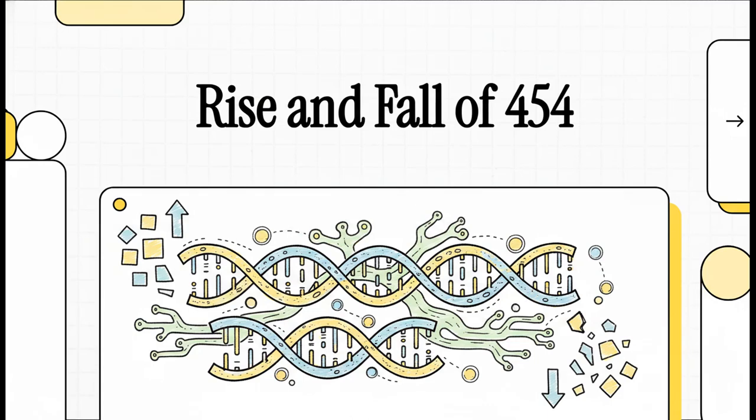Today we are diving into a truly dramatic story straight from the world of biotechnology. We're talking about the groundbreaking pioneer of next-generation sequencing, a legendary piece of tech known as 454 sequencing. Now, this system completely changed the game in genomics. It literally opened the door for massive parallel DNA analysis. But despite its absolute brilliance, it tragically didn't survive the highly competitive market that it essentially helped create.